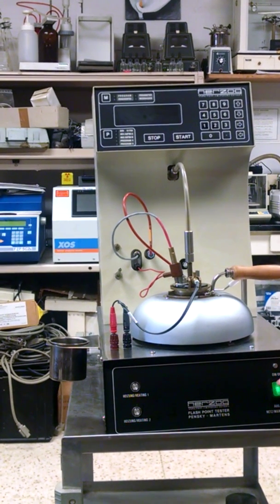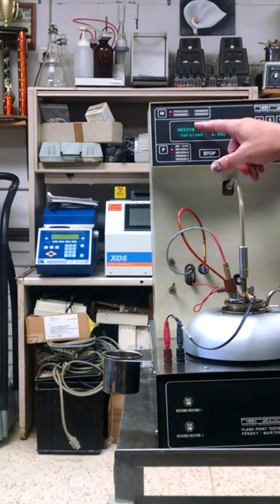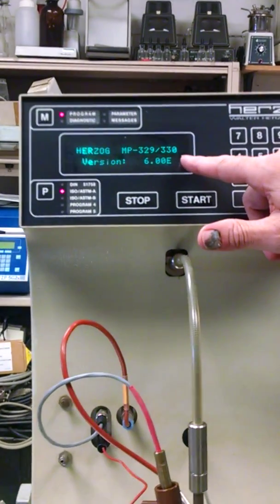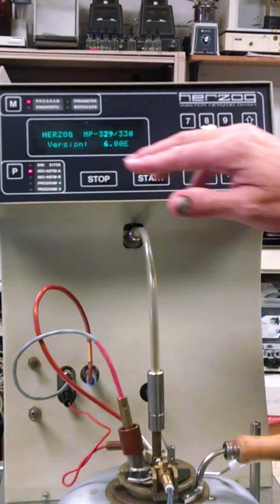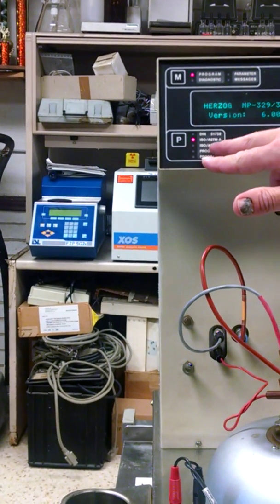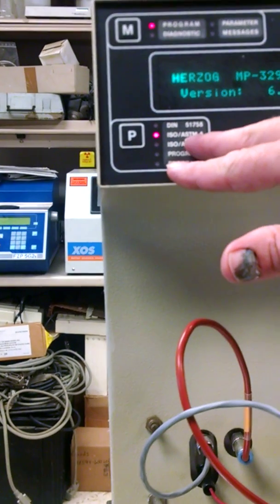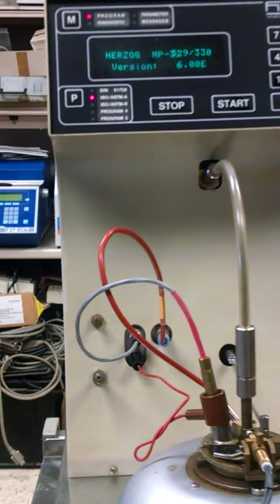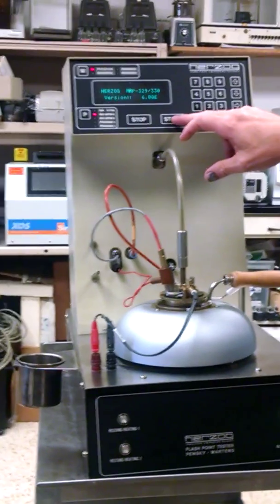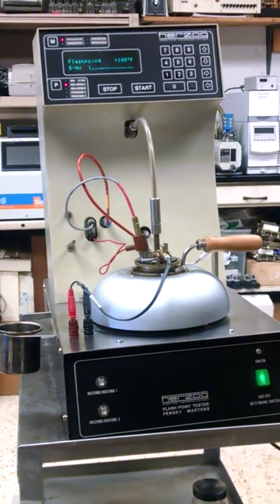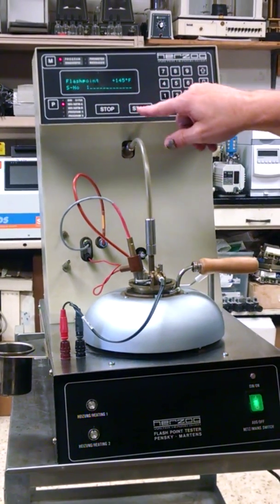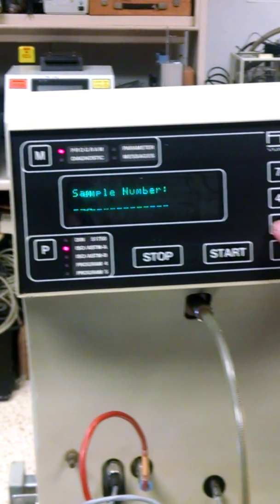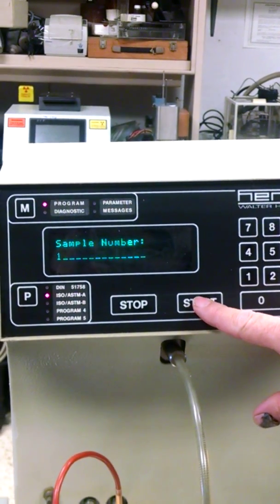Then we're going to turn it on and you can say it says Herzog MP329-330 version 6.00E. Now it's got method A and method B. We've got it set on method A right now. The difference between method A and method B has to do with the stir speed. So what we want to do is first we want to hit start and then it's going to say your number. We're just going to put in number one. We're going to hit start again. It's going to sample number. We're going to put in sample one and we're going to hit start again.